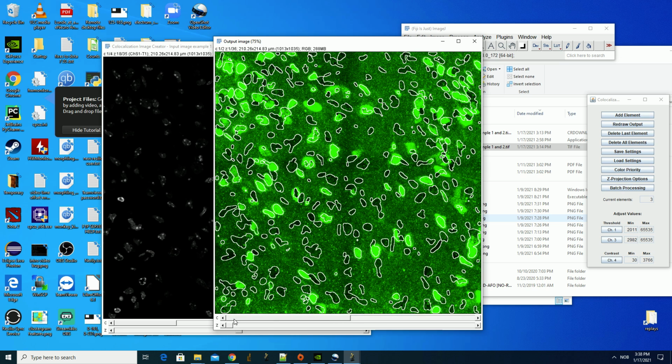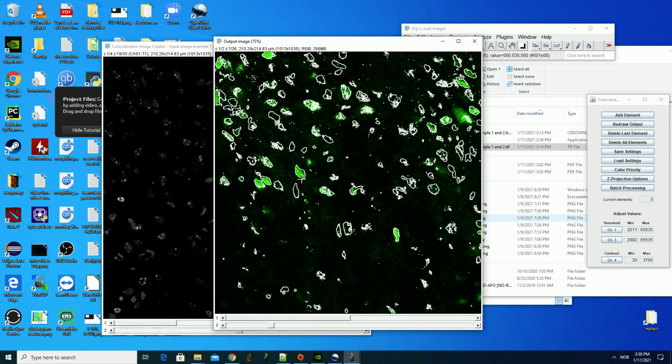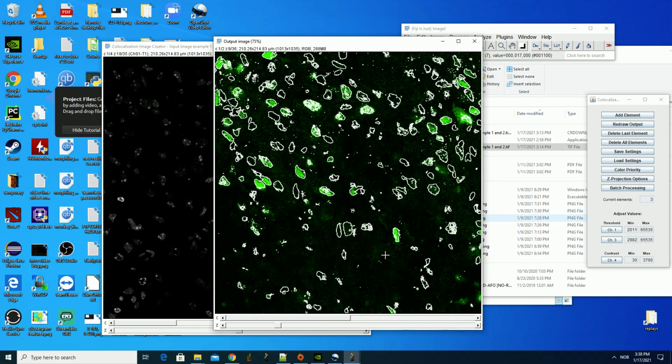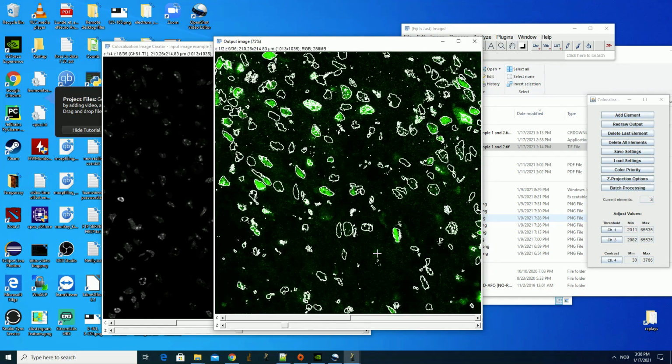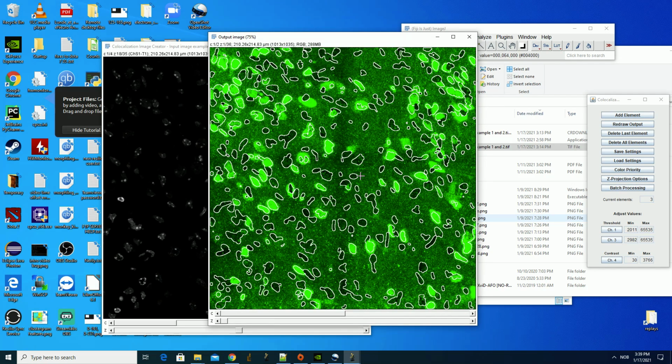And of course here you have all the nuclei in the white outlines, and you have, I believe it was, channel 4 in the green. So you already have a lot of representation of different types of colocalization events. And yeah, we will later see how we can use the second plugin to actually quantify and count these different types of colocalization events for the different cells.